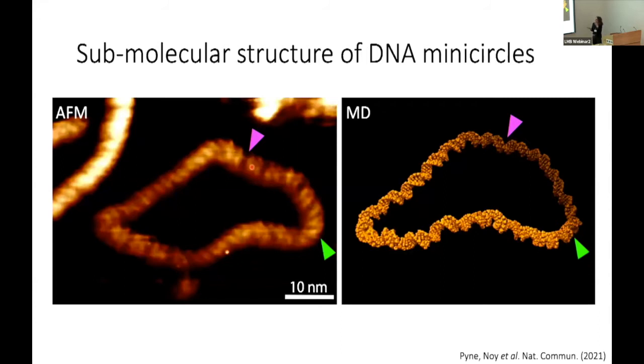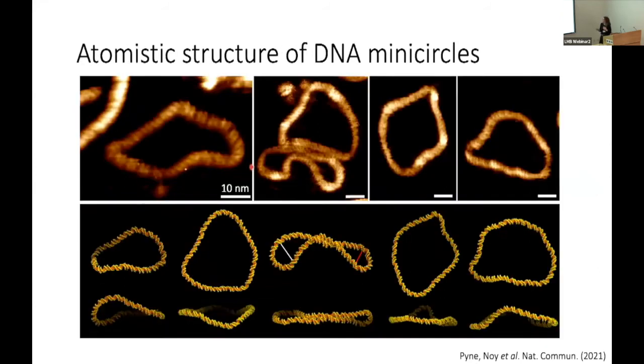So we're seeing what we saw before on the larger plasmids. We're able to correlate this with MD simulations, which later on really helps us because they know where all the atoms are. And we see this at 2 length scales. So we're able to see this over 200 bases and 350 bases. And what we see is really nice agreement between the MD simulations and the AFM.